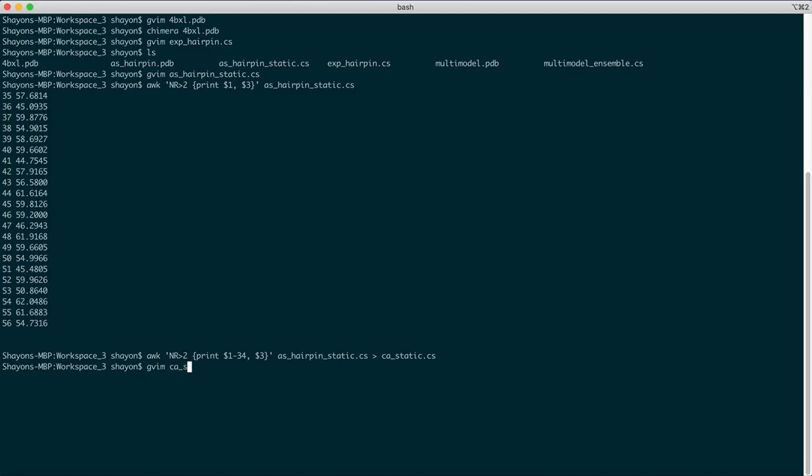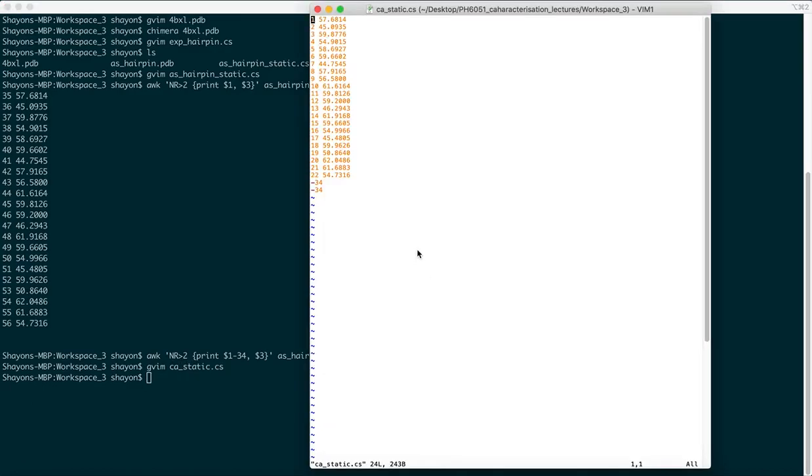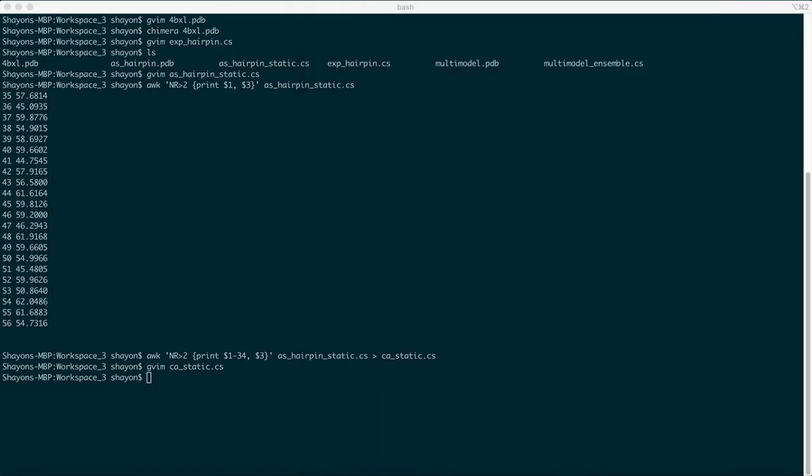If we open this new file, you'll find that all these fields are written properly. Okay, so these additional numbers that you have here is because of the blank spaces at the end, which we can get rid of by selecting them and deleting them. So that's fine. Okay, so 1 to 22 here, that's all done. And then we escape this and save this file separately and have a quick look at the predicted chemical shift values for the ensemble.